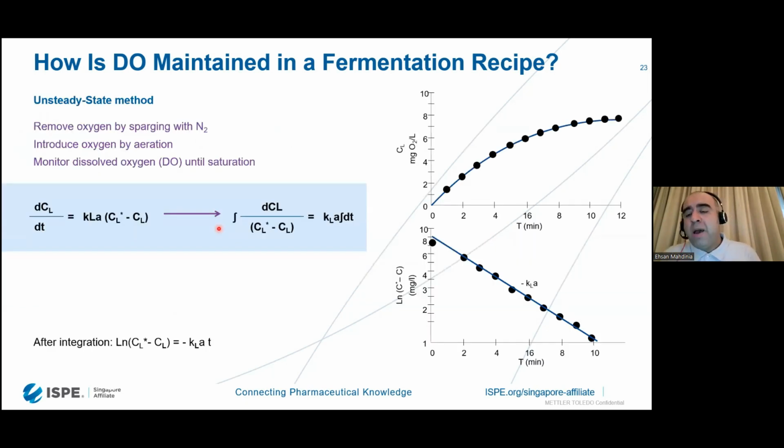And so why is it not as common anymore? Because you need to come up with the sulfite solution, and the samples you need to take are a little bit elaborate to take to the lab and measure the concentration. Of course, when you expose your samples to the air, the oxidation keeps going. There's a little bit of inaccuracy inherent in there.